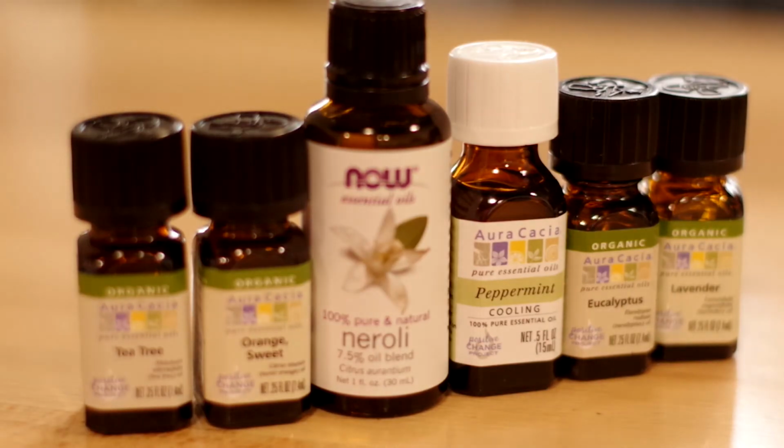Using this method, we analyzed terpenes from 6 essential oils using headspace GC-VUV. In the simpler odor profiles, such as sweet orange, we only see one peak of interest, that being limonene. In the more complex odor profiles, such as tea tree or lavender, we see multiple peaks of interest. One interesting aside is that the neroli oil did not actually contain any nerolidol, which would make this method good for authenticity screening.